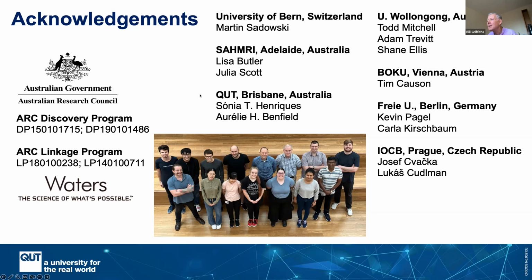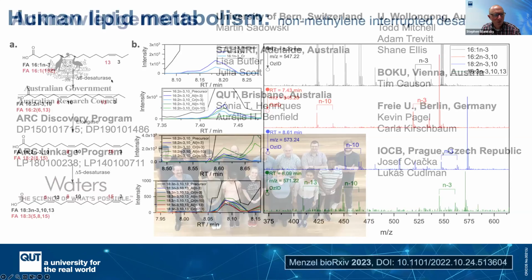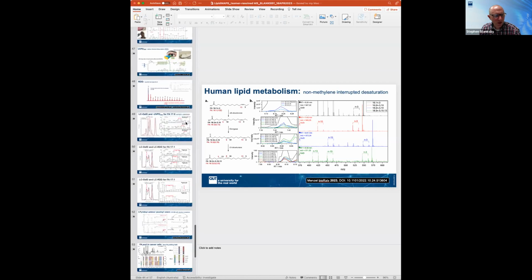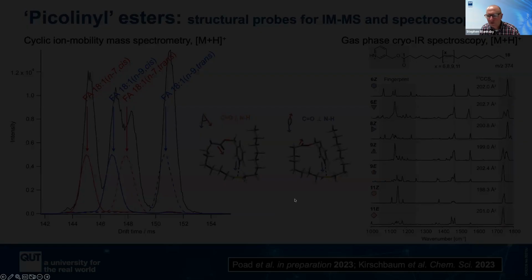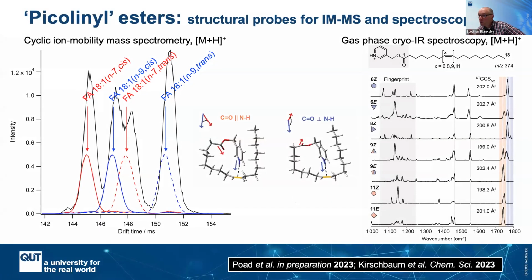What about ion mobility mass spectrometry for complex lipid composition? Do you use that with the ozonolysis? Yeah, there's a configuration that we have explored where we've done ozonolysis first. We've done that on the Agilent systems, where you can do ozonolysis almost as the ions are in the ion funnel before they enter the ion mobility. So there you're relying on the chromatography at the front end to do some of the cleanup and some of the separation. Then you're doing the ozonolysis reaction, and then you're using mobility to separate out some of the ozonolysis products.